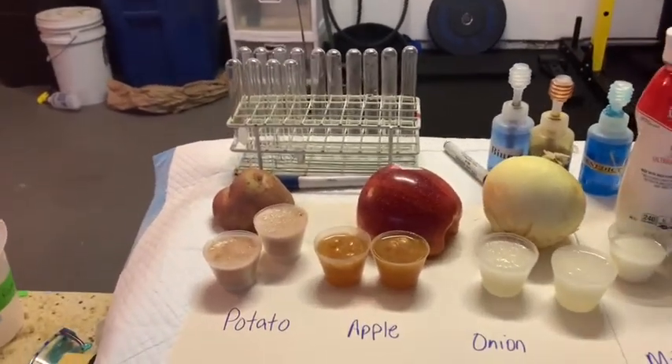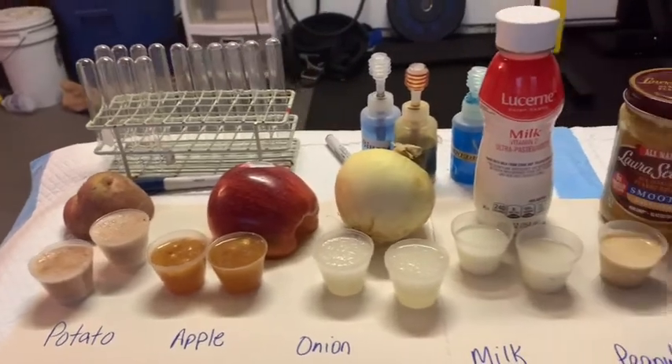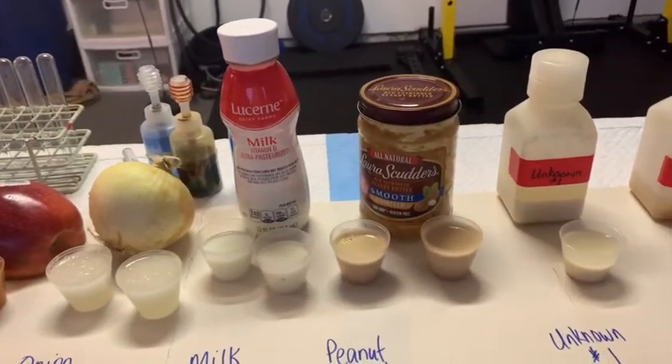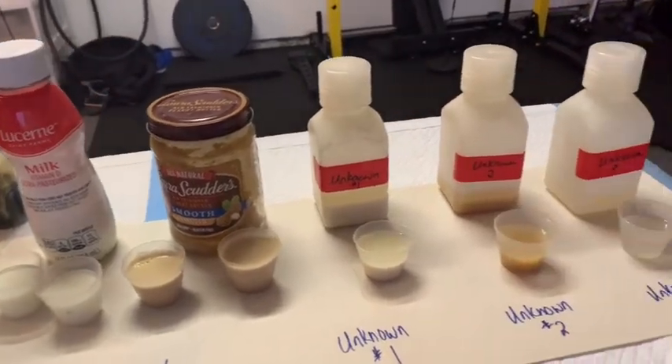So here we have some potato juice, apple juice, and onion juice. We've got our milk. I've taken some peanut butter and mixed that up with some water to make a little peanut smoothie. And then we have our unknowns 1, 2, and 3.